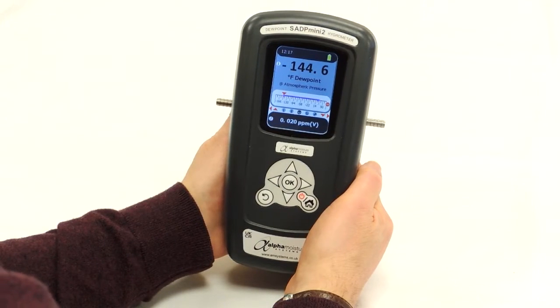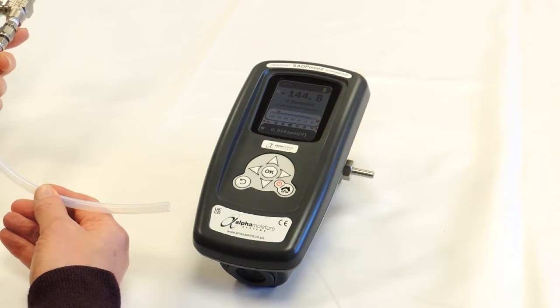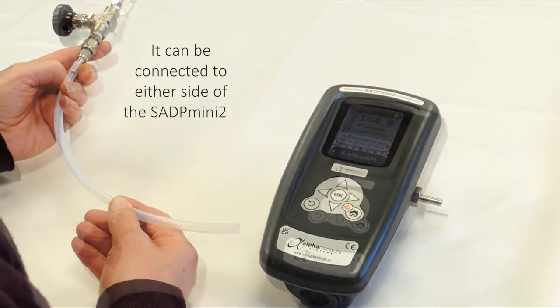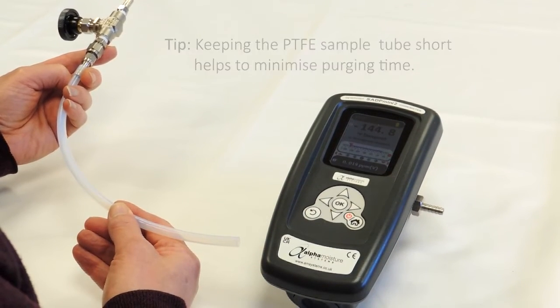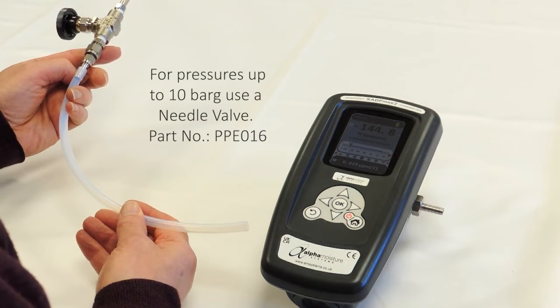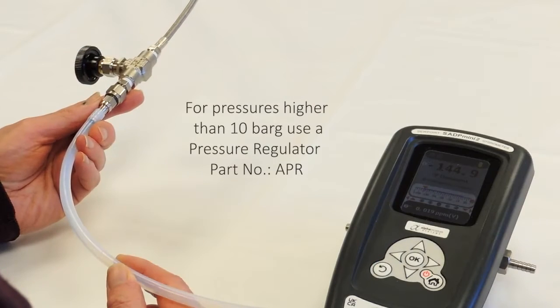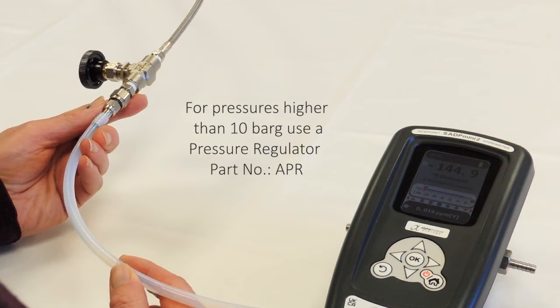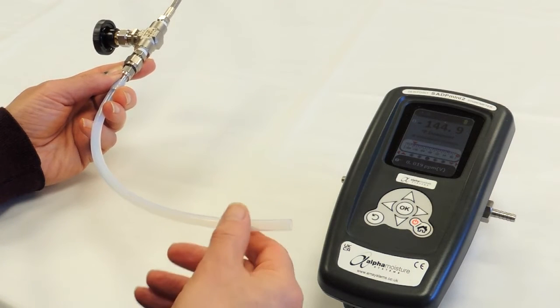The following procedure for sampling will give you the best practice and also the quickest results in taking a sample. In this example, we have a dry gas bottle connected to a needle valve via a vented stainless steel hose, which represents a sample point. From the needle valve, we have a short length of PTFE tube which we can connect to the Mini 2. The pressure in the bottle is about 10 bar, which is approximately 145 PSI. So in this case we are using a needle valve. For pressures higher than 10 bar or 145 PSI, we would recommend a pressure regulator instead of a needle valve at the sample point.